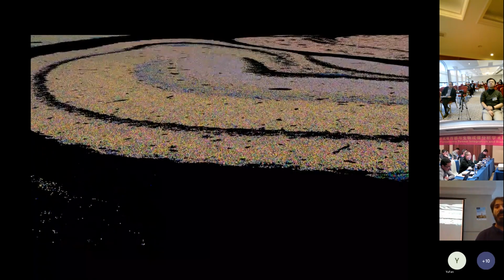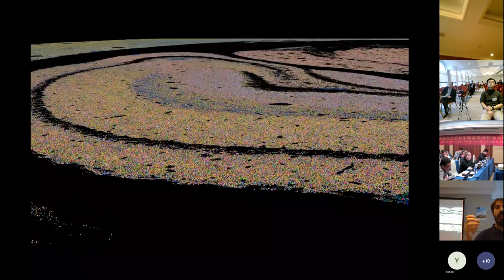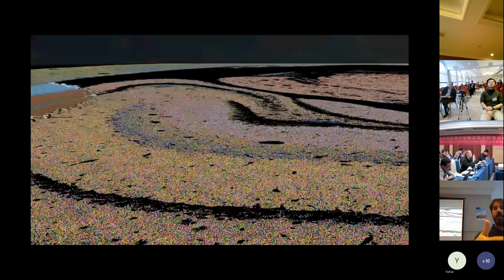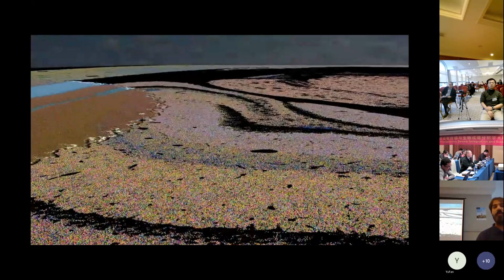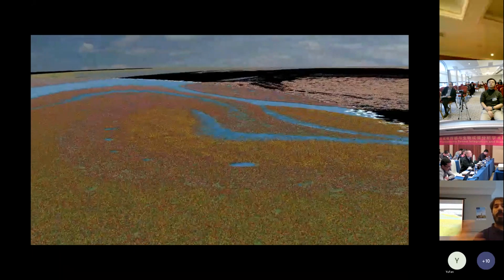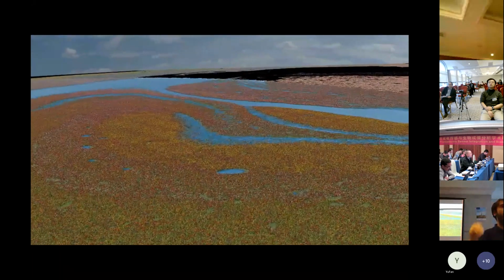I want to close with another way of viewing this data. We've done all this work and have this very efficient way of viewing the data, so we can do more. For example, we can set up a camera to just explore the data in 3D in the world. Here we can see the hippocampus. For public engagement purposes, we would map the individual puncta to flowers.